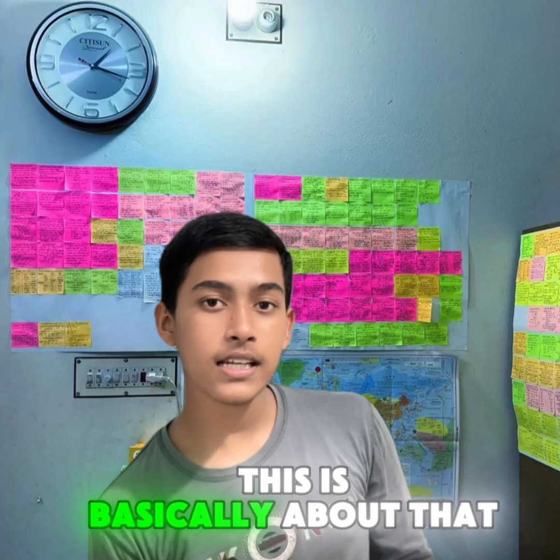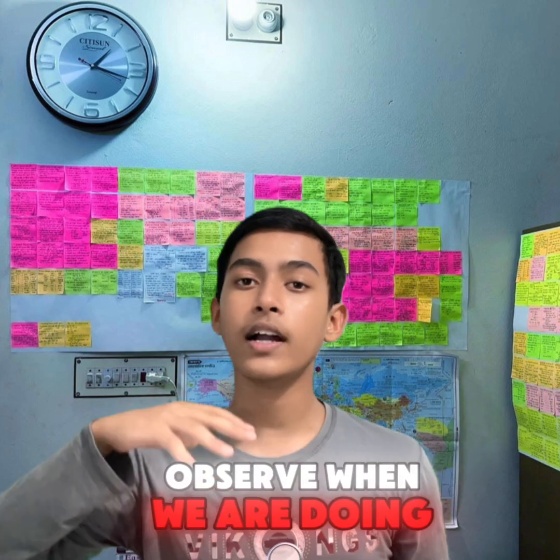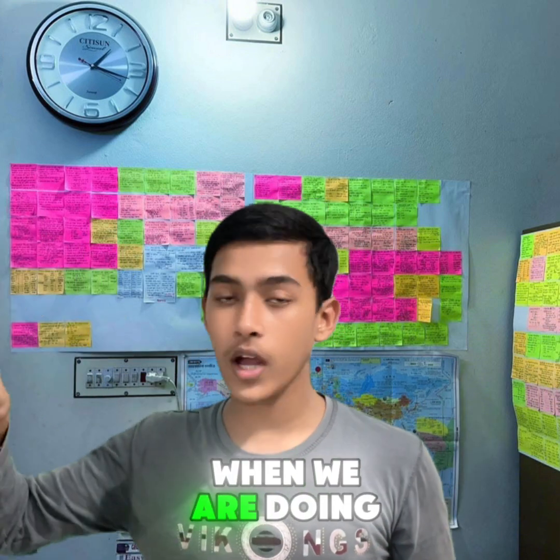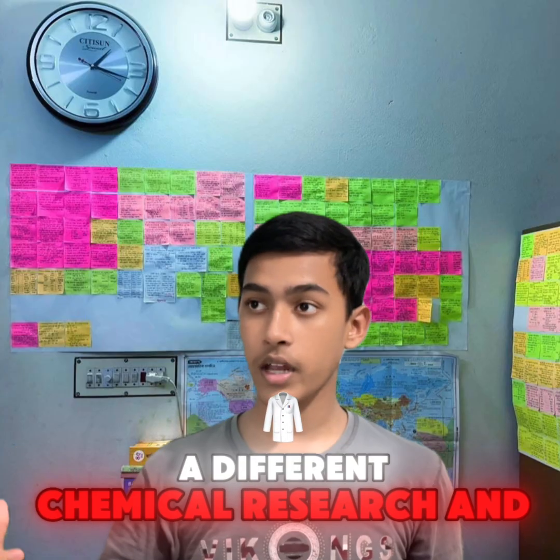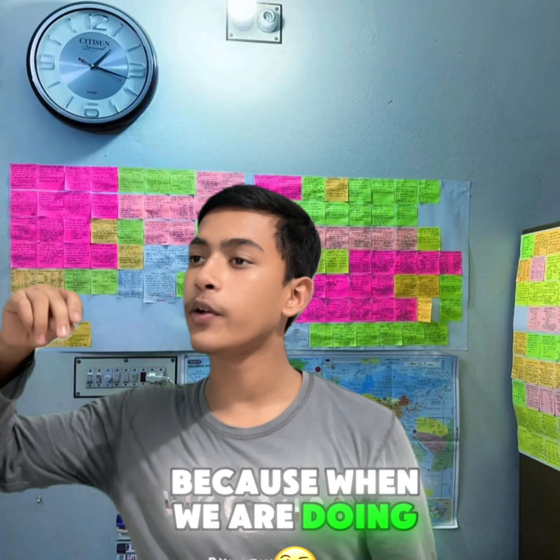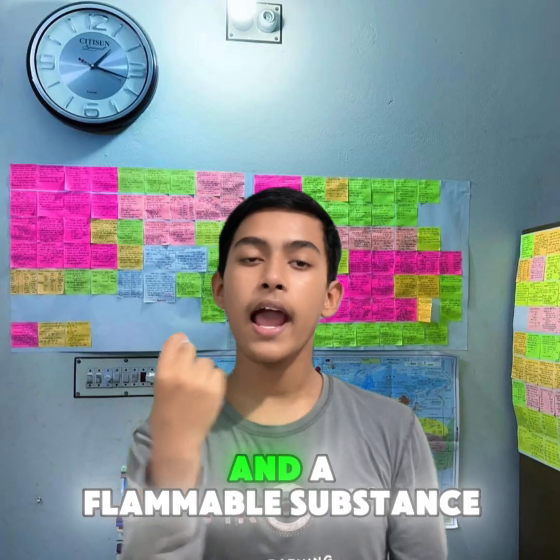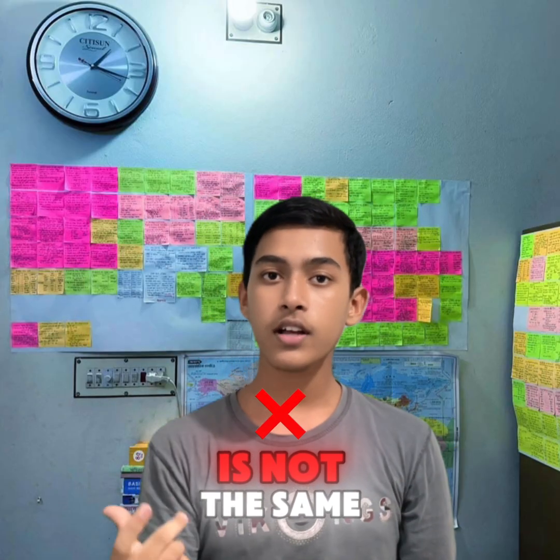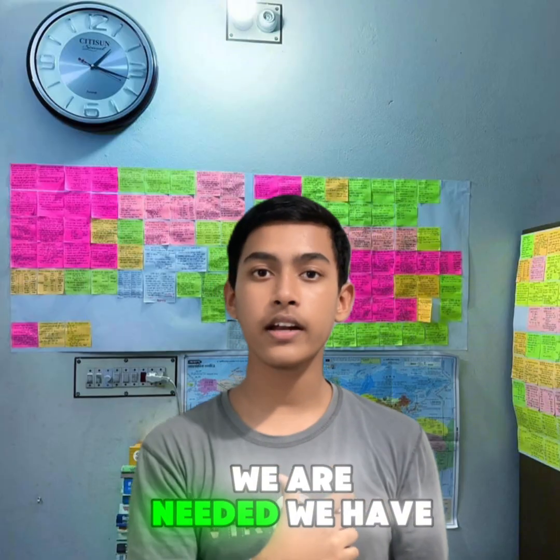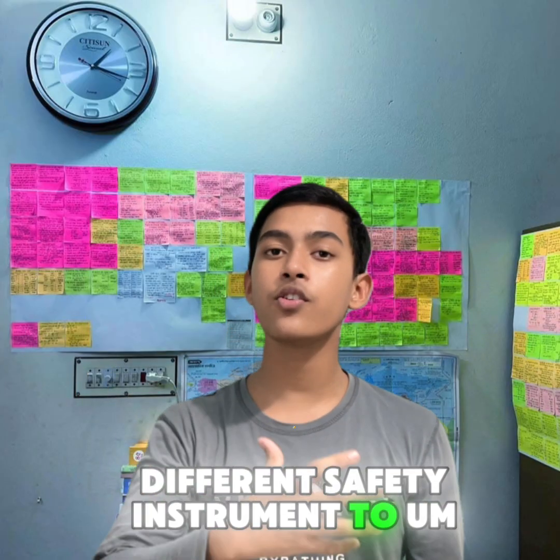So this is basically about what safety we should observe when we are doing different chemical research. When we are doing research on explosive substances and flammable substances, the same safety is not needed. We have different safety measures and different safety instruments to protect ourselves.